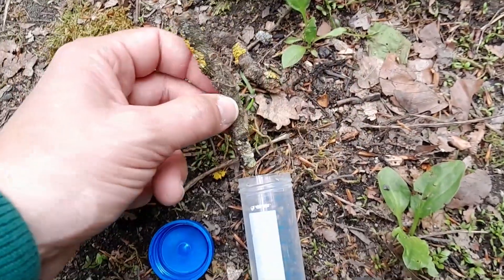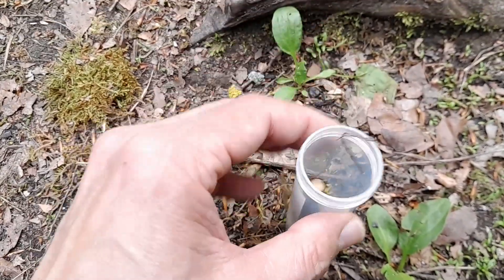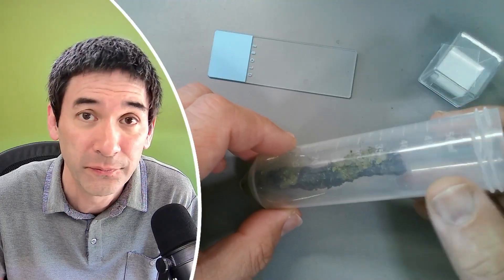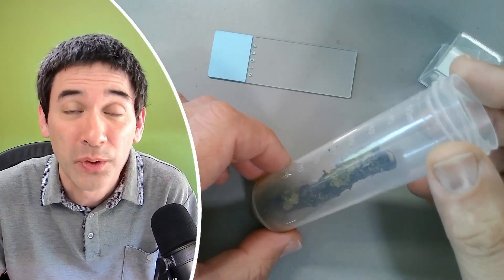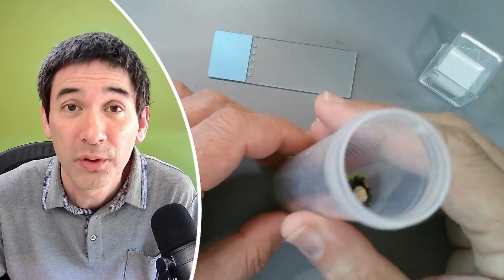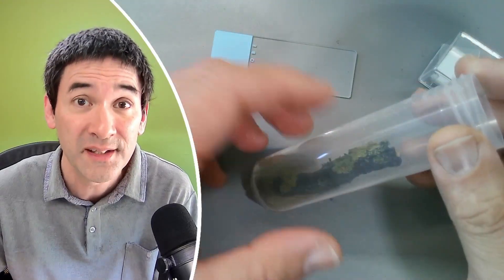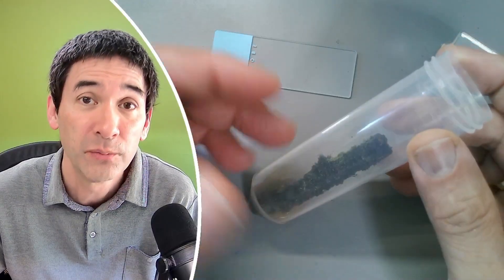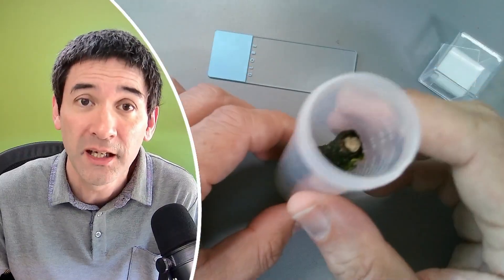This piece of wood that you see here was completely dried up. I found it several days ago in the forest. Usually when samples are dry you're not able to see a lot of movement and a lot of life under the microscope, because anything that was alive before has either died because of the dryness, or some microorganisms are able to form cysts that can withstand the dryness. You have to add a little bit of water and wait a couple of days for them to come back to life, to regenerate and to reproduce — and that's basically where we are right now.